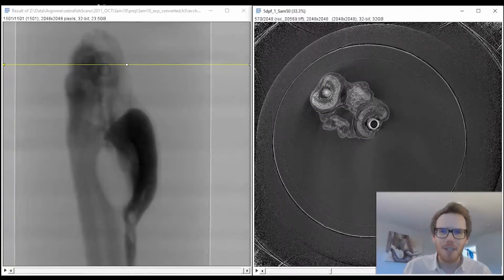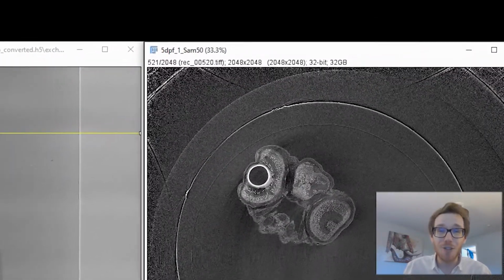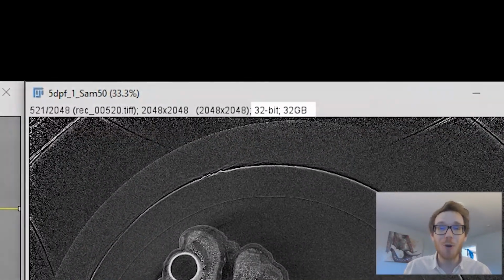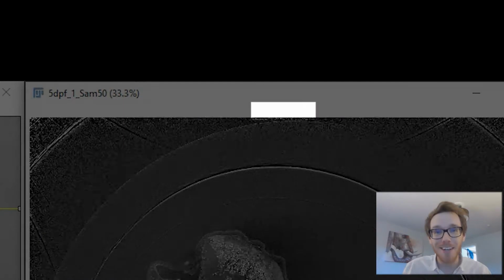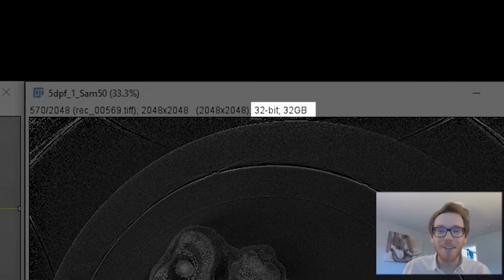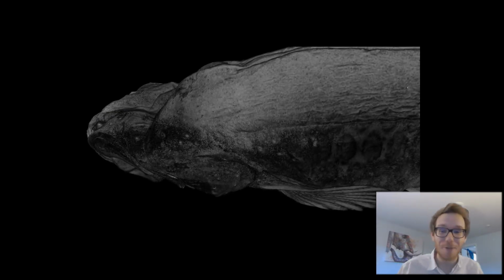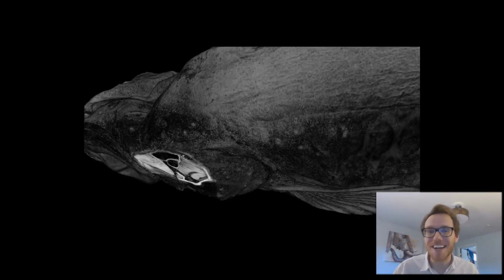If you shift your attention to the top left of this current window, you'll see that the image stack is actually 32 gigabytes, which is just totally massive if you want someone to download your file to look at it. Just keep that in mind. Now that we're halfway through the presentation and still haven't gotten to the web app, one last distraction.